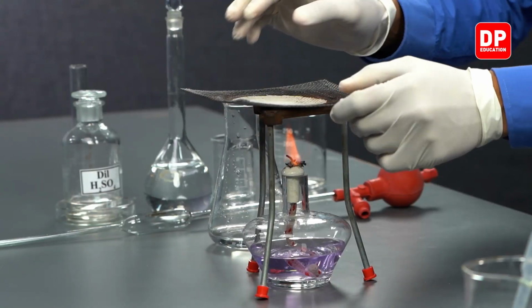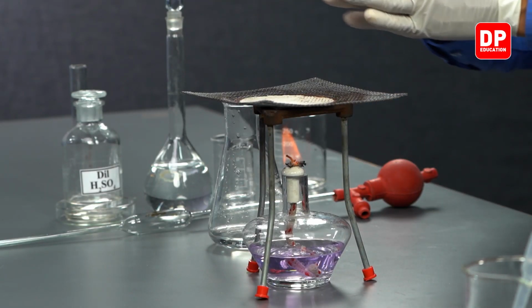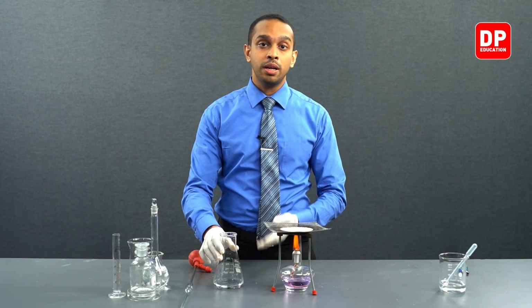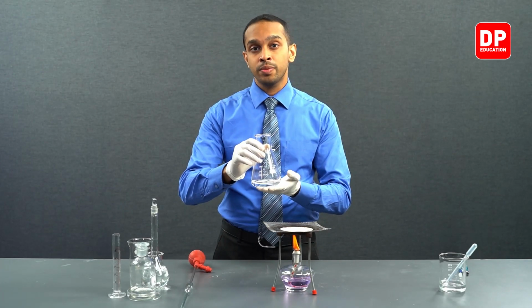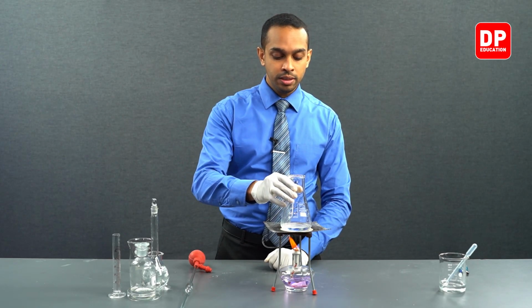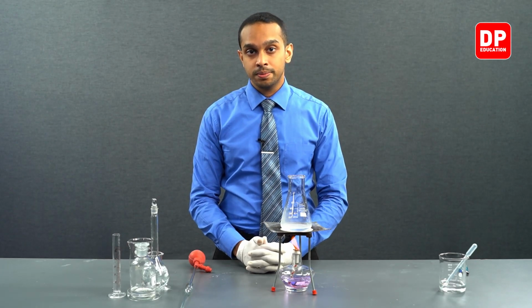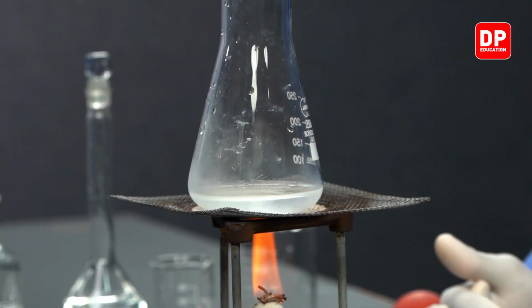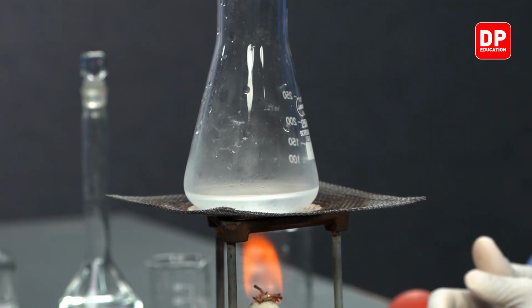It is important to make sure that we place a wire mesh because it will help in distributing the heat evenly, making sure that the heat provided by the spirit burner is received by the beaker, or in this case a titration flask, evenly. So we will place the titration flask over here and allow it to warm up for a few minutes. And then we will be moving on to filling up our burette with the potassium permanganate solution.